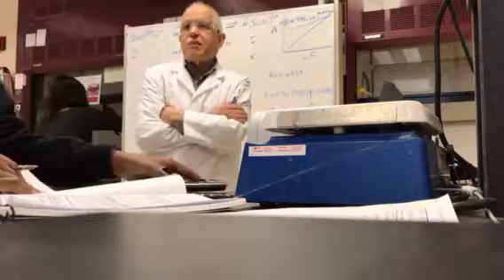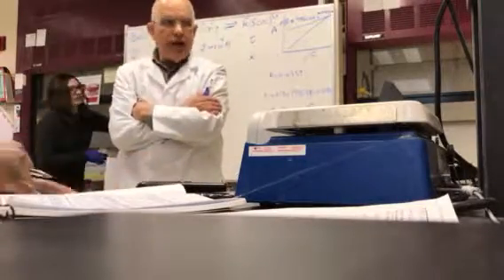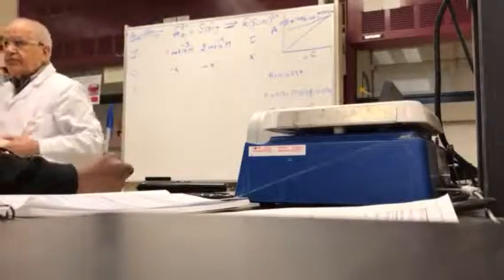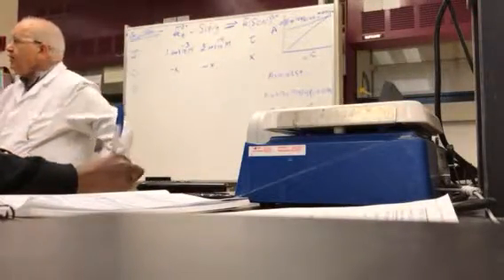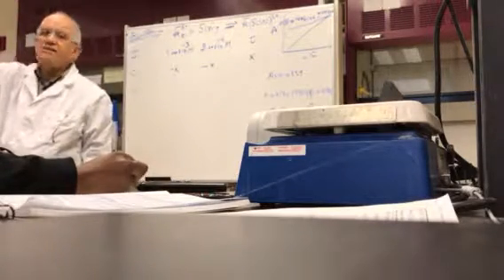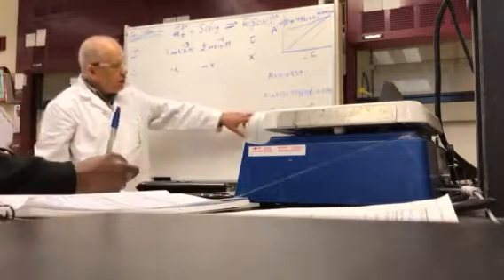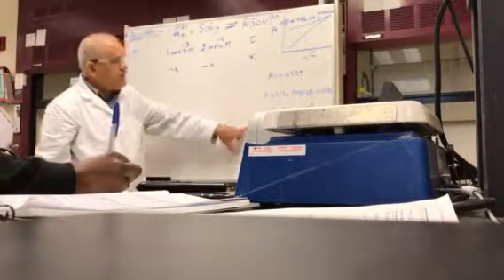Is this clear? Question, please ask me if you have a problem with this. For every tested tube, we measure the transmittance. We convert it to the absorbance. And we go back and say, okay, what's my value x? That's where x comes from.